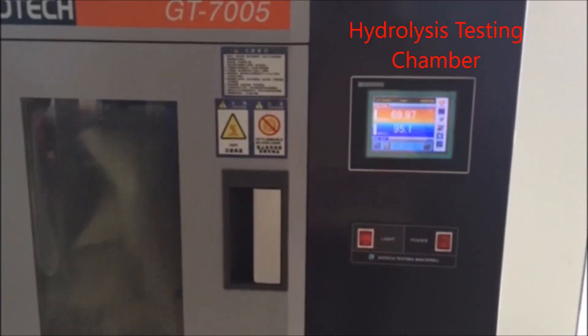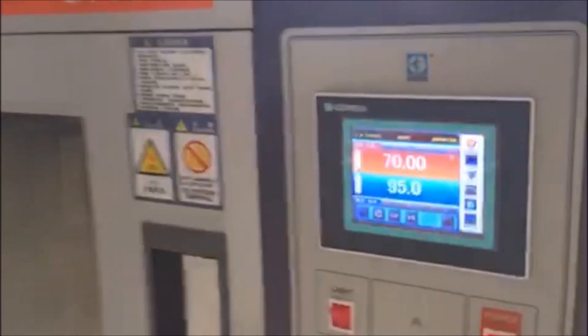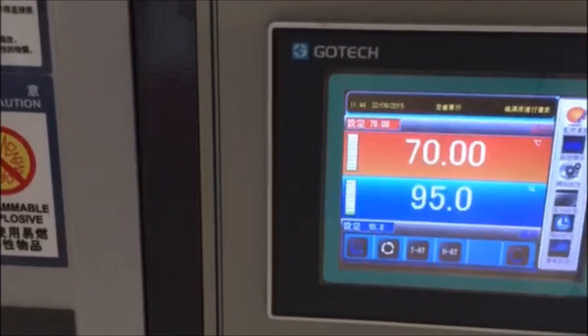These are hydrolysis chambers. You can see where the temperatures are set on the hydrolysis chambers, and you can see the material inside. These are all the chambers for hydrolysis — controlling humidity and temperature.